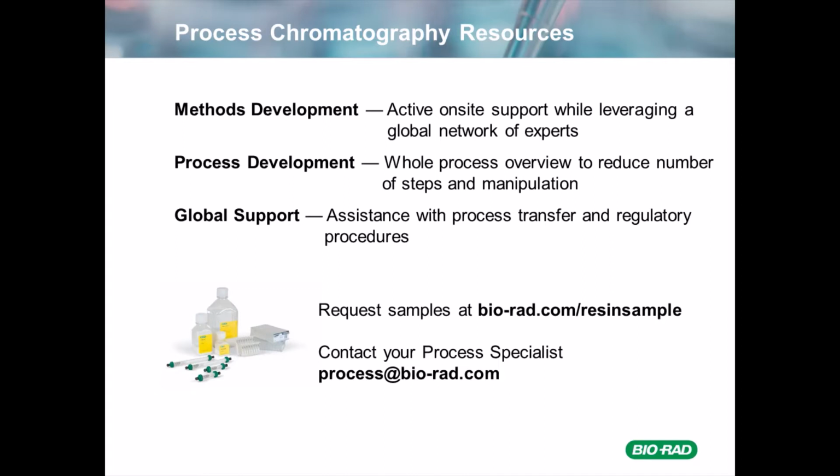However, as I have shown in the presentation, process manufacturing is about the purity and the yield of a target. So we will have to do our due diligence in resin selection and method development instead of simply picking a resin on the basis of a single output like recovery. So if you want to discuss this in a little bit more detail, you can reach us using the email I just showed you.